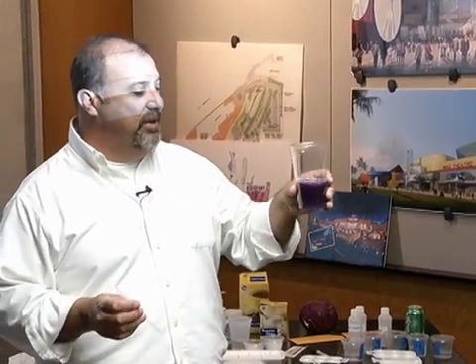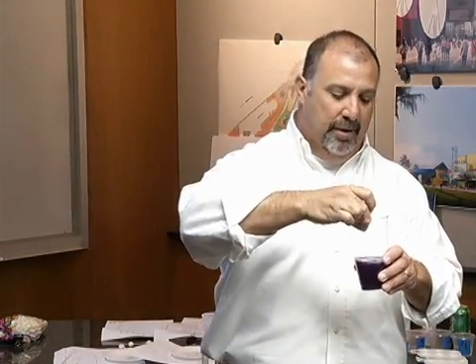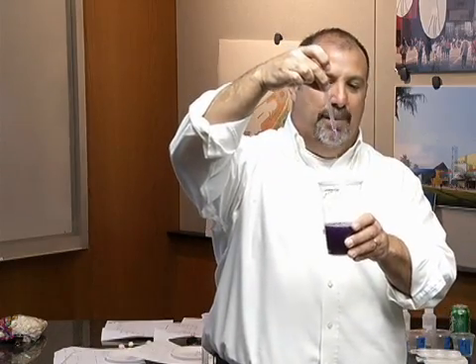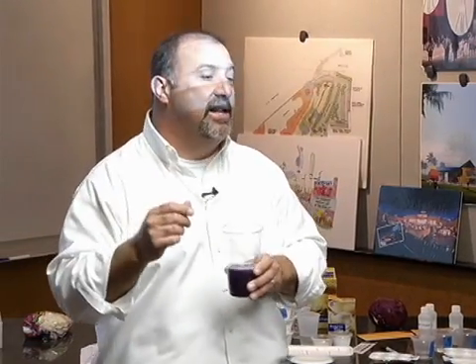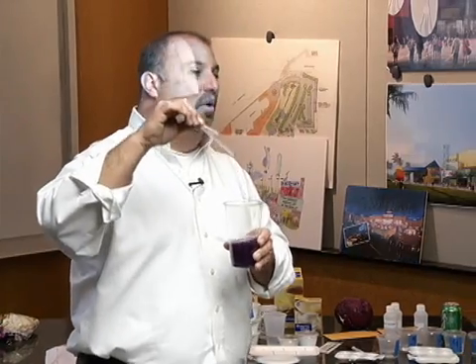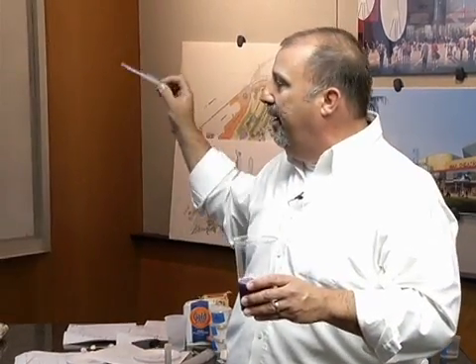We'll do the same type of thing. We're going to use our straw as a dropper, put it in there, and then drop. We're going to drop several drops. If you get a little bit of chunk in there, that's fine. But drop enough that you can see whether or not there is a color change. It may take more than just 1 or 2 drops, depending on how much liquid you have in there. Start filling these out, and when we come back, we will see how close your guesses are. So go ahead and start your cabbage juice.